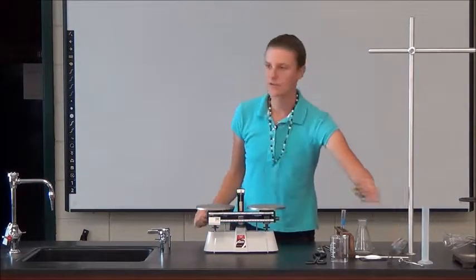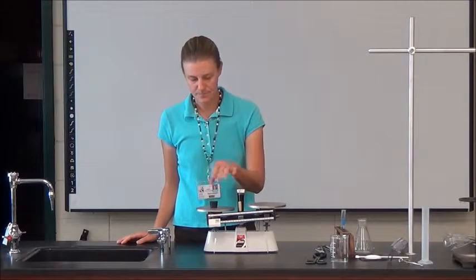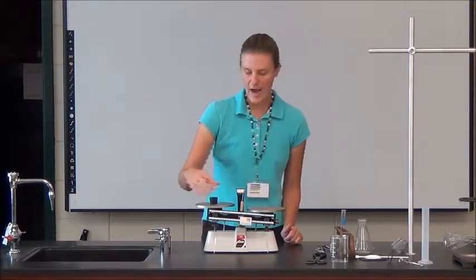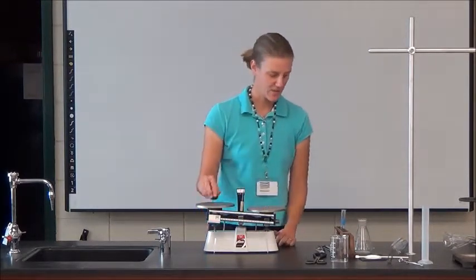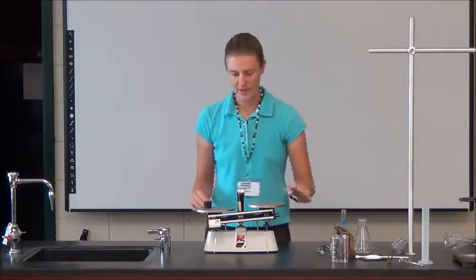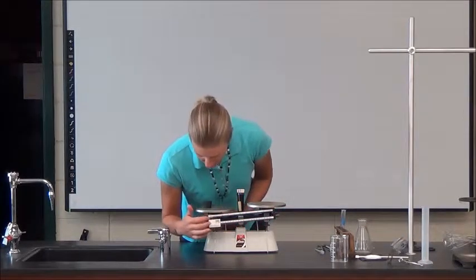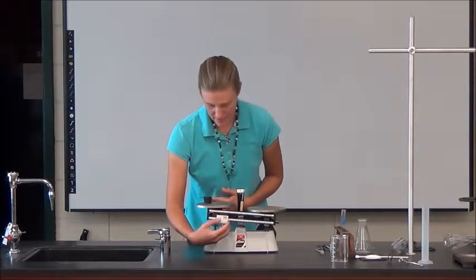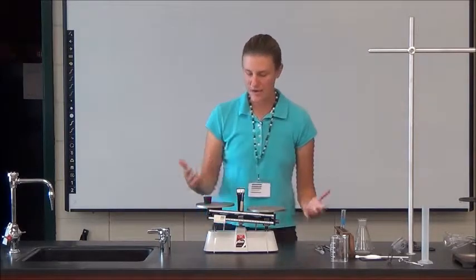Let's say I want to mass something, like this rubber stopper. What side are you going to put it on? The left side — very good. You're going to put it on the left side because these are sort of your counterweights, countermasses, and then you can slide them away from your object. Always start by sliding the bigger one first. If it's too heavy, back it up. Then you get to the point where you can move the smaller slider and just add them up. That would tell you your mass.